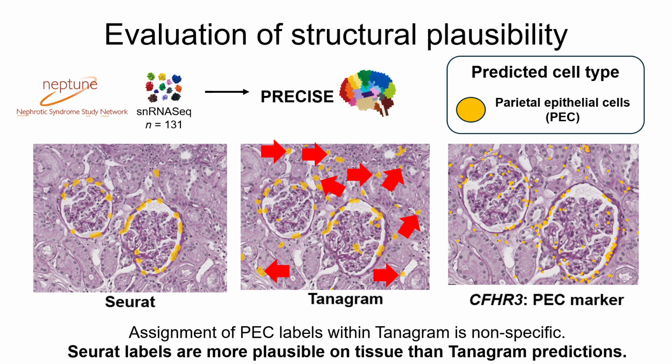And then the second thing is, those are just probabilities, and we really want to be able to look at these cell types on the tissue to verify if they are plausible and making sense. And so what I'm showing you here are some of the transferred labels, and I'm showing you the highest scoring Tangram samples so that we can have Tangram looking as best as it can.